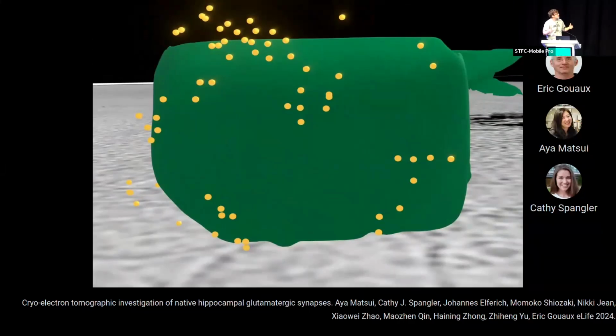But if we really want to understand it, the problem is, right, it's cut off at the bottom and the top. And we don't know, are we looking at the edge of that synapse? Like what's really going on then? But that part was literally vaporized, right? It's sticking to the walls of your FIB-SEM. So the question is, is there another way of making these preparations where we don't lose all that really valuable information?